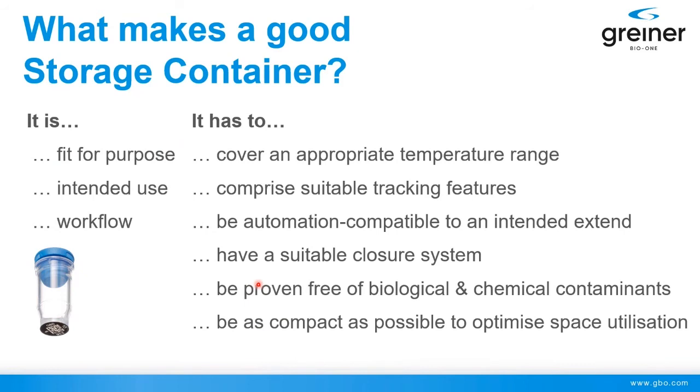And often, and I didn't have the time to talk about it today, it is good that a storage container is also compact and space optimized, because what you don't want to do is to waste storage space because you have big plastic containers with little lumen and volume at the inside. What you want to do is store a sample, and the container is just a thing you need and can't avoid, but this shouldn't take up all your volume.